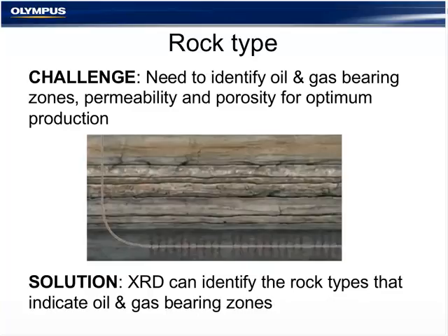Some of the key minerals and elements that are critical to understanding the unconventional reservoir are minerals that can indicate brittleness, such as quartz and carbonates; trace marker minerals and elements at boundaries; high trace metal values, especially vanadium, nickel, uranium, molybdenum, are all good indicators of organic richness; minerals and elements associated with natural fractures; pyrite and manganese can be indicators of oxidation and reduction states during deposition or early diagenesis; and clay minerals, especially expandable clays, and clays as they relate to clay diagenesis.